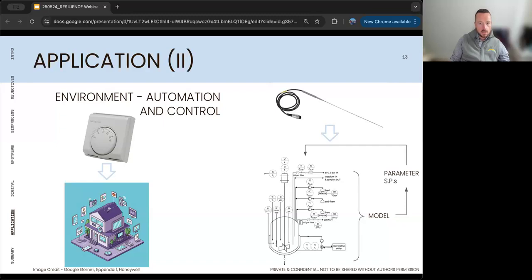If you think of a slightly different example in terms of dissolved oxygen, there's a whole swathe of different influences on the bioreactor system that affect what is arguably the most essential thing for a living organism to exist and to grow in the form of the oxygen itself. So the temperature, the media composition, the gas composition, bubble size, gas flow rates, the mixing environment, all of these influence oxygen, but it will only ever really be controlled in the context of two of those readings that it has.